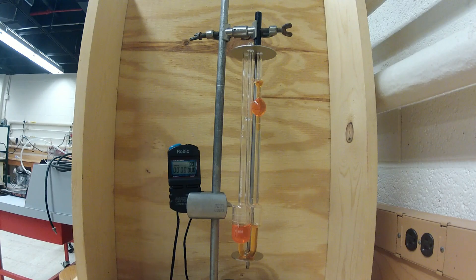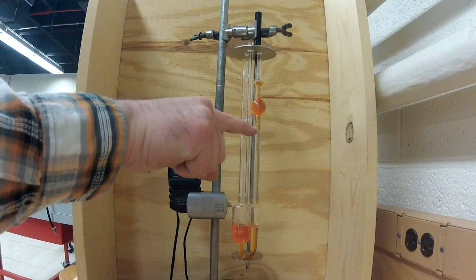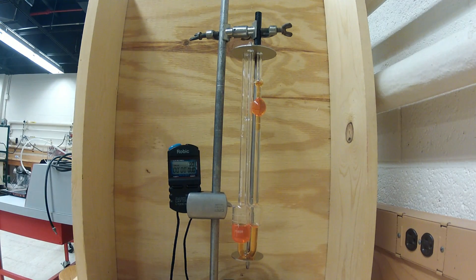Once this has been done, you can disconnect the hose from the end of the viscometer and remove your finger from tube 3. This equalizes the pressure within the viscometer, as shown in the reservoir, and allows the fluid to flow through the bottom of the capillary.